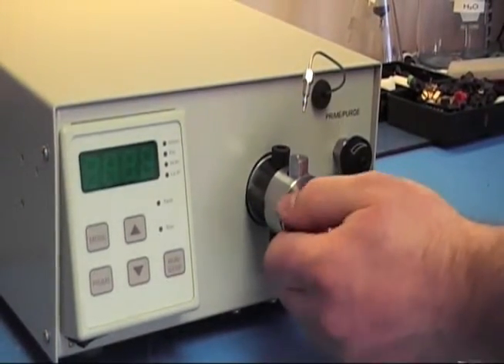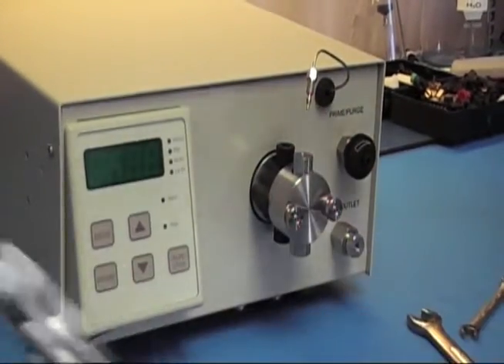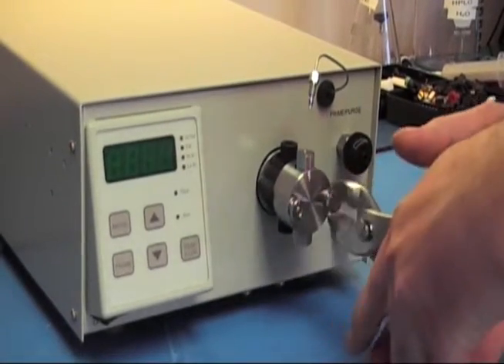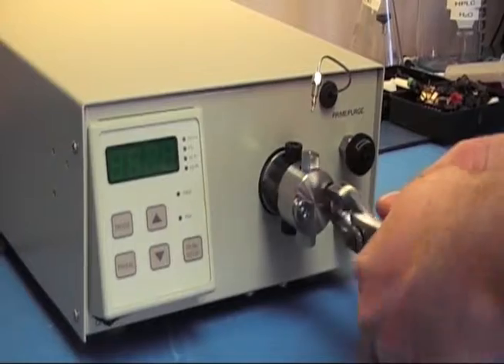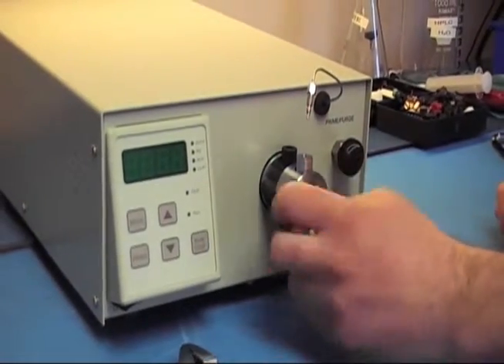Next, you're going to need to loosen the thumb nuts that hold the head on to the pump. Just get your pair of pliers, loosen them up, and remove them the rest of the way with your hands.